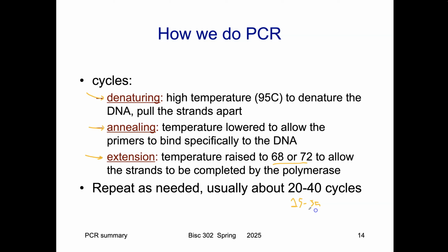I have seen PCRs that use more and fewer for different purposes, but on average we repeat this multiple times, and it's just in a little machine, a thermocycler, that makes those temperature changes for you once you've put everything you need into the tube.